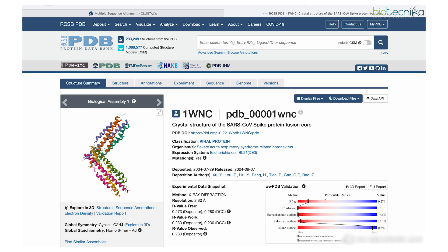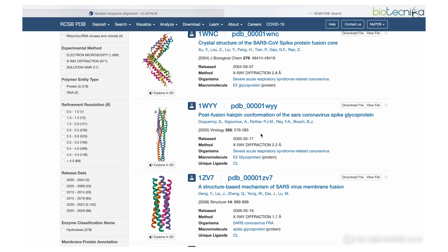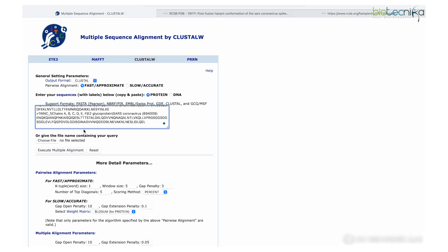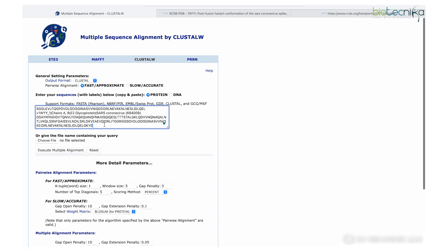Three is the bare minimum for multiple sequence alignment, because for two sequences pairwise alignment handles it easily using global or local approaches. I'm showing you by example with the minimum. For the third sequence, go to display FASTA format, copy it, and paste it in. You can do this for many sequences — the maximum limit ClustalW holds is 4,000 sequences. Here you can see three sequences are now pasted in.